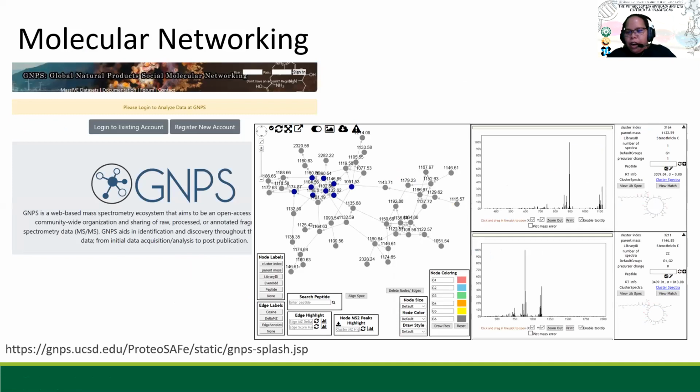Recently there are a lot of improvements or advancements in terms of molecular networking. So with LCMS, GCMS, untargeted metabolomics, you generate a lot of data, you do chemometrics, you only try to identify the metabolites that are found to be significantly different or significantly differentiating. And so with that, you limit yourself. The rest of the data is not used. So kumbaga na di-discard na or nawawalan na ng gamit yung the rest of the data.